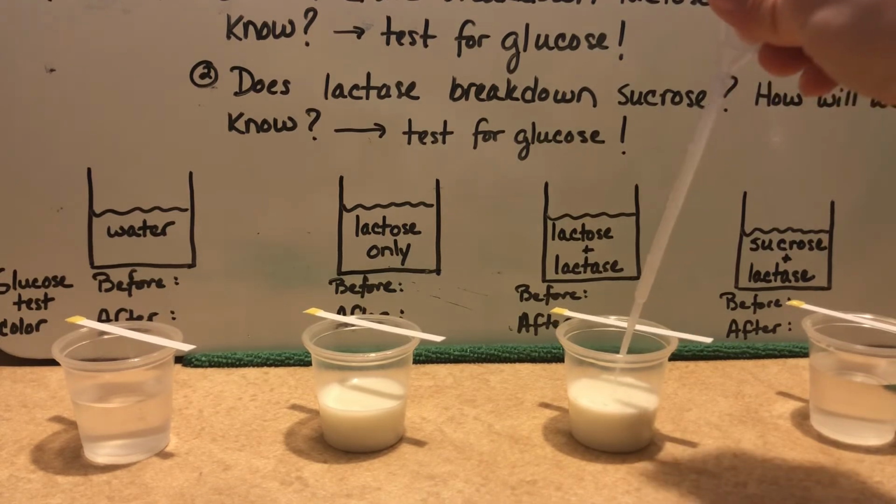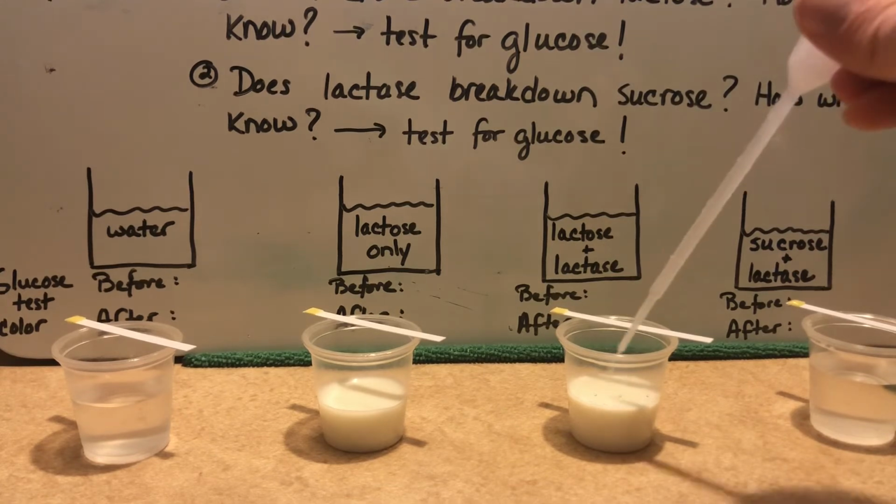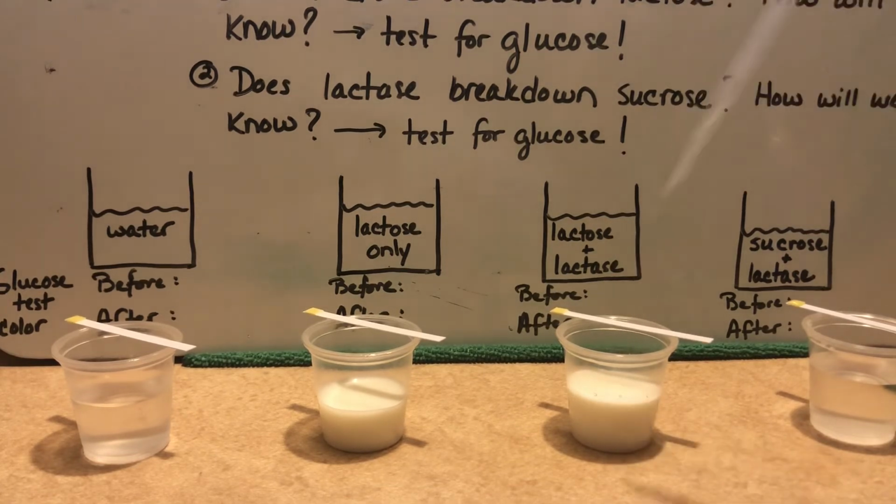This one is supposed to get the enzyme, not that other one. And we need to add some enzyme to our last one.